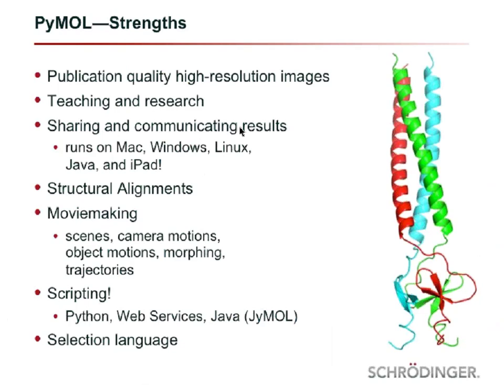Then, because PyMOL is very fast in starting up, loading structures, changing representations, and looking at details, it is very useful for teaching and research. Probably 90% of the times when I fire up PyMOL, this is what I do, just looking at things, looking at details.